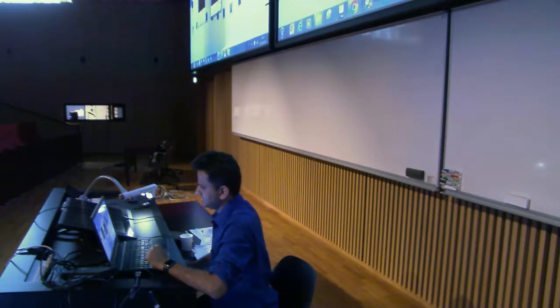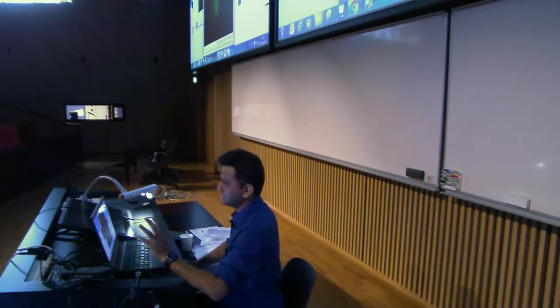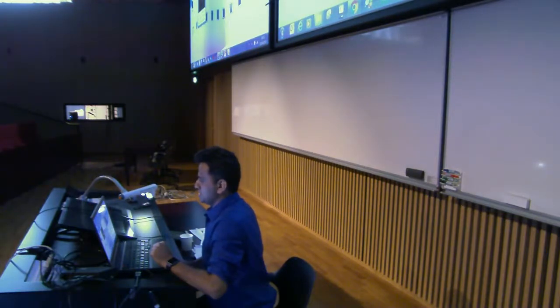Okay, you see here, it's kind of the Imaris way of looking at the data. Because there is no Z, it's kind of a volume rendering actually in Fiji, but it is not as good as other commercial software. That's kind of a big drawback of working on the 3D data. So this is all about this one.